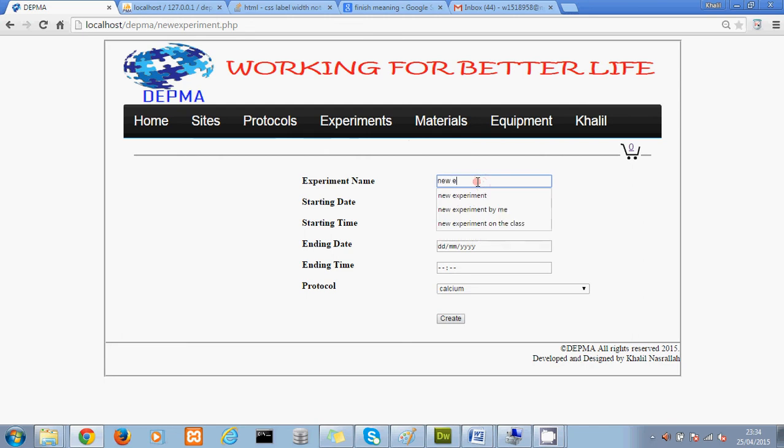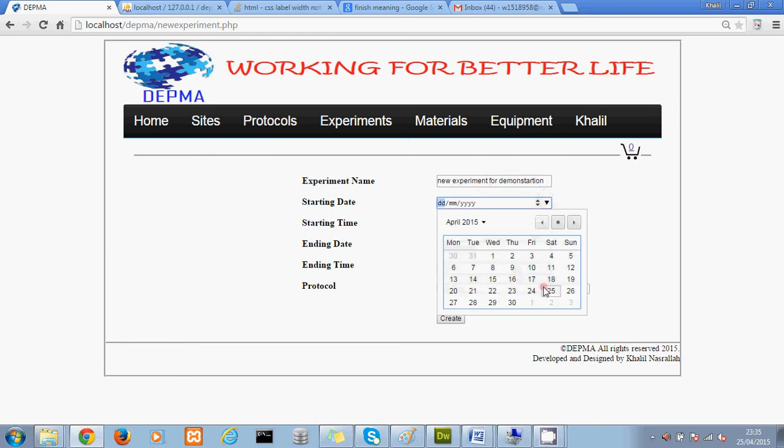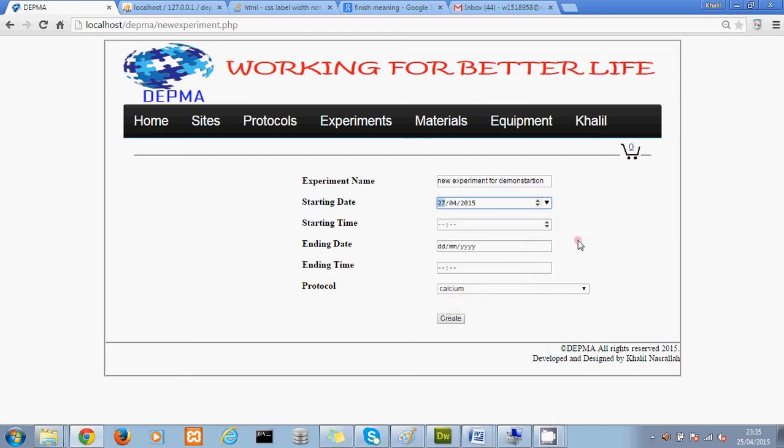New experiment for demonstration. Starting day, let's say starting by Monday, 27th of April. Starting time is required. Okay, so the starting time is required. Let's say it's going to start at 10 past 4 a.m. Ending day is not required. Ending time also is not required.